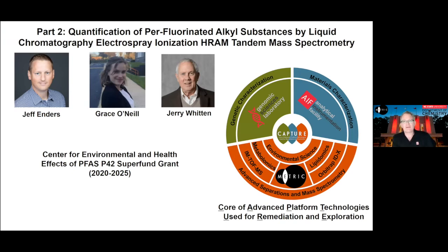So the second part of my talk is a different type of exposure, and this has to do with the quantification of perfluorinated alkyl substances. This work is done with Jeff Enders, a graduate student in my group, Grace O'Neill, and a colleague of mine, Jerry Whitten. We wanted to develop a new liquid chromatography electrospray mass spectrometry methodology in support of a new Superfund grant that we were awarded here at NC State.